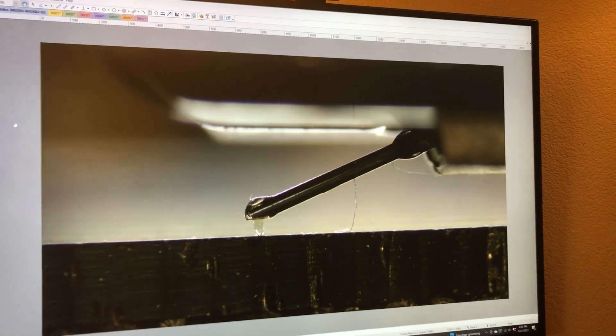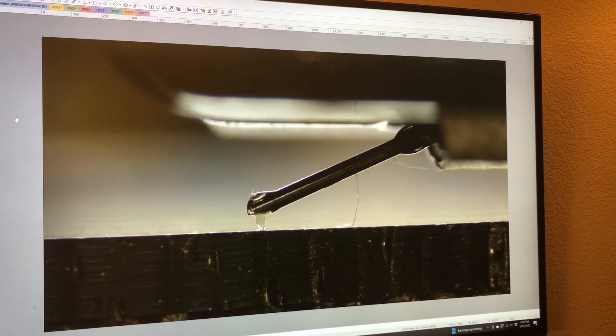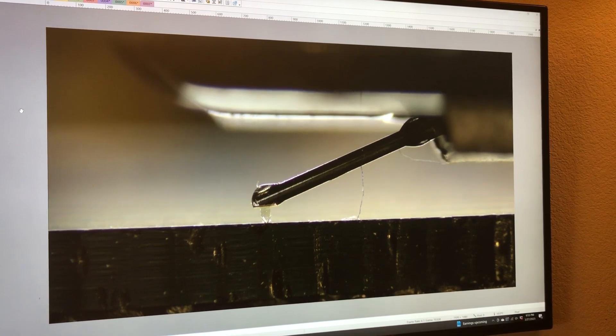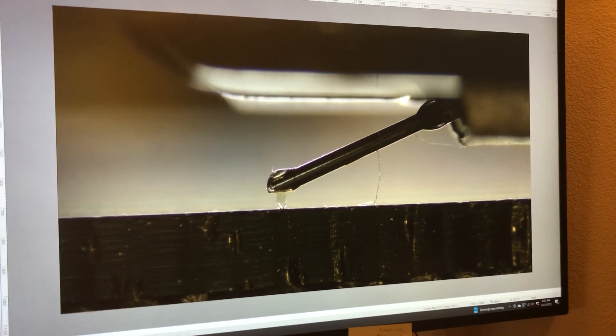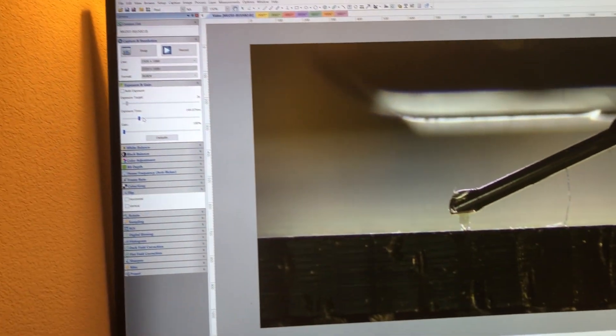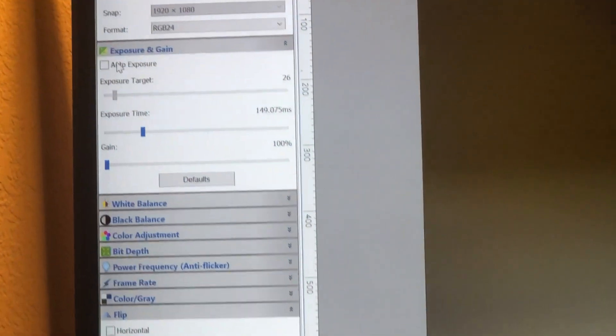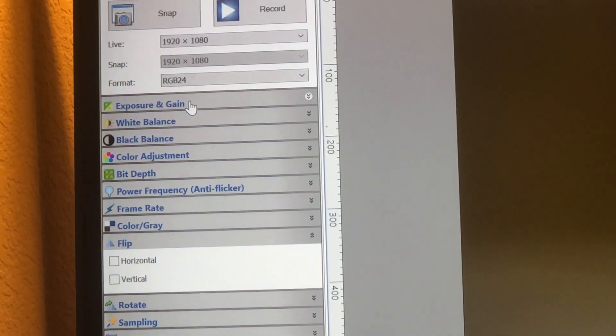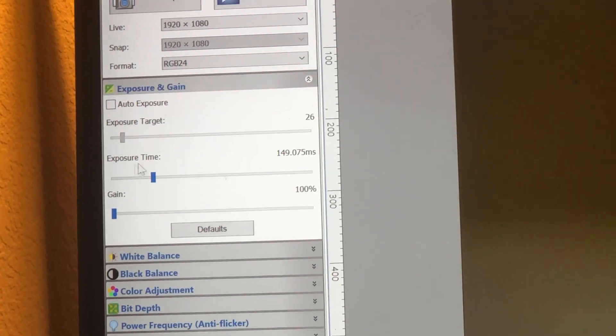A quick video on exposure time. Over here on the left side of the menu bar you'll see there is this control under exposure and gain. Just open it up by clicking on the bar and you'll see this exposure time here.